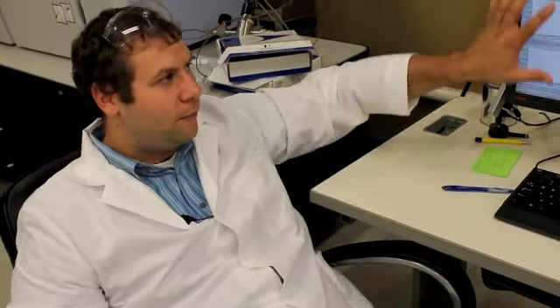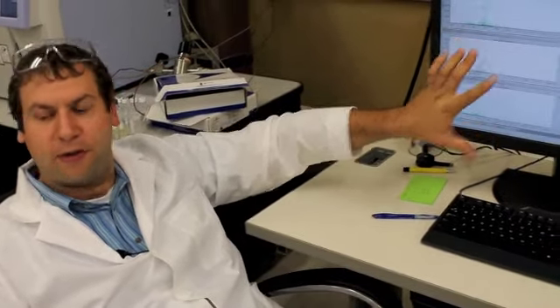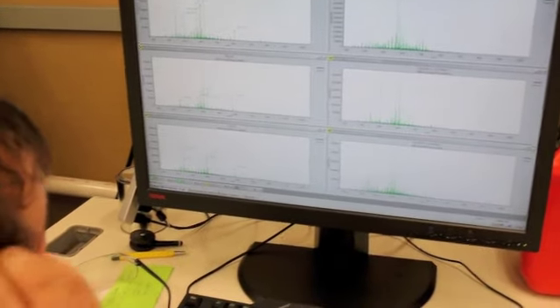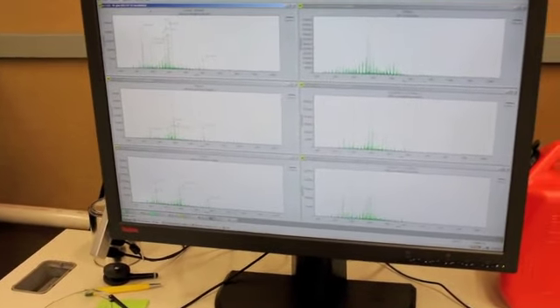They're all going to have things in there that are pretty much the same. They're all going to have sugars. They're all going to have that caramel color. They're all going to have these unique natural flavors. And so, for the most part, these spectra are probably very similar. The hard part is, I guess, going through the data and seeing if we can find the unique peaks that are indicative of each one.